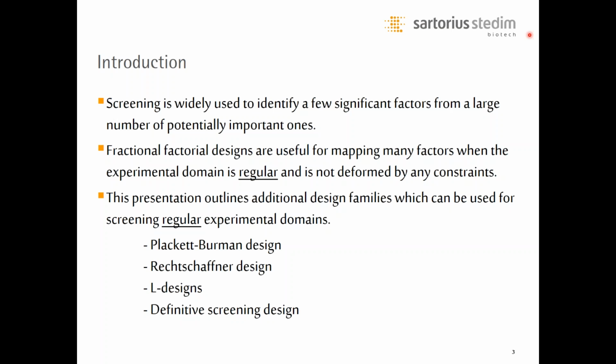Here we see a little introduction of today's presentation, and we will concentrate today on screening designs that work when the experimental domain is regular. So in a general sense, you can say that screening is always used to identify a few significant factors from a rather large number of potentially important ones. And the most frequently put forward recommendation using the MODDE Pro 12 software are designs drawn from the fractional factorial design family. But as I told you, they apply when the experimental domain is regular.